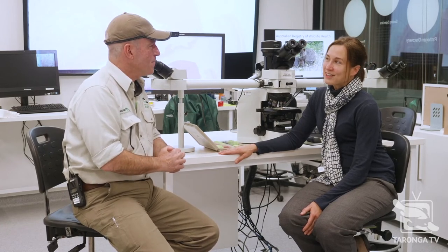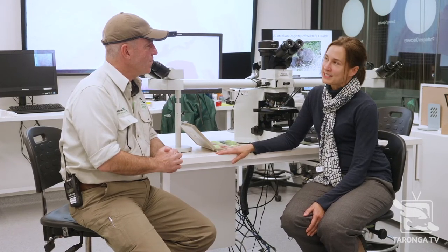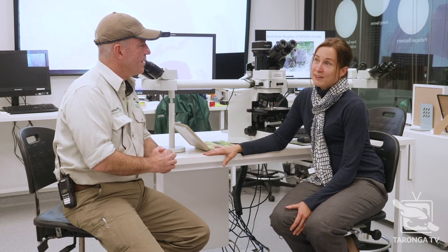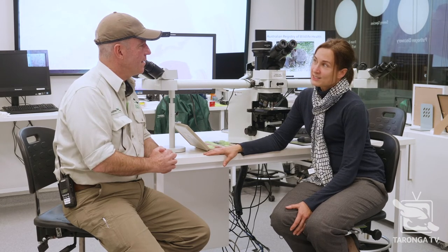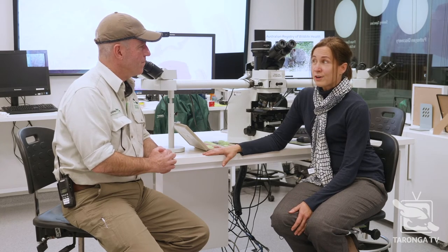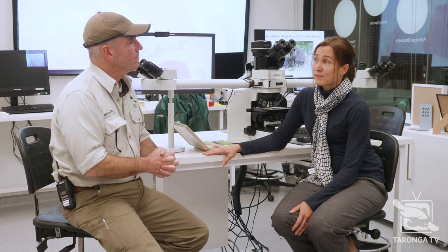Oh, thanks, Hayden. I'd love to. So at the Registry, we have a fantastic role. It's a really unique applied science role. So it's just fascinating to bring you and all the Taronga TV people with you. So we have a very fortunate position. We provide a diagnostic service for free-ranging wildlife. So the main people we do that for are both the state and the Commonwealth Environment Department.